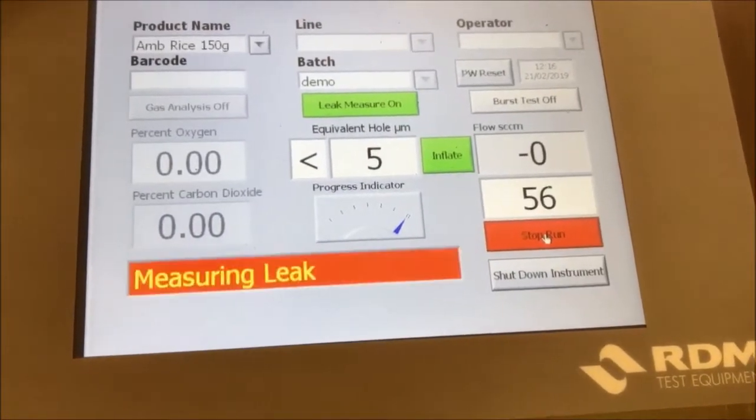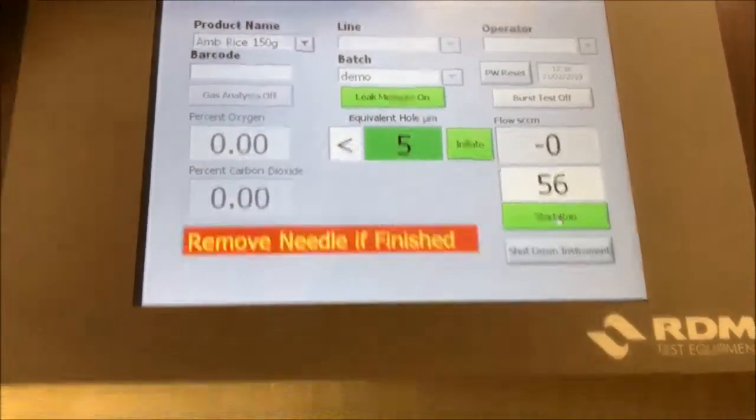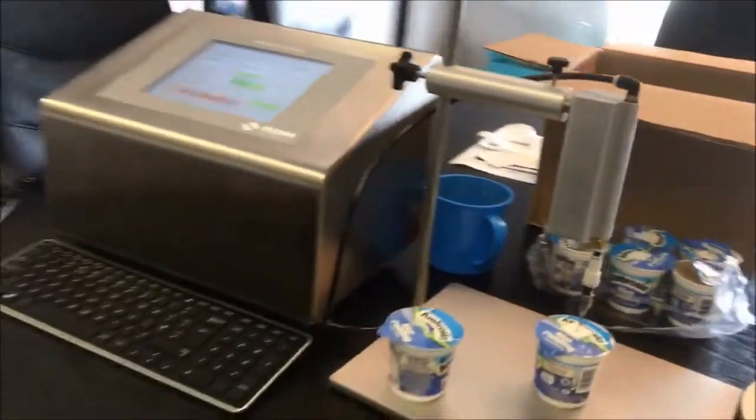That's the leak test on the first one, so I would say that is the pack that is not leaking.